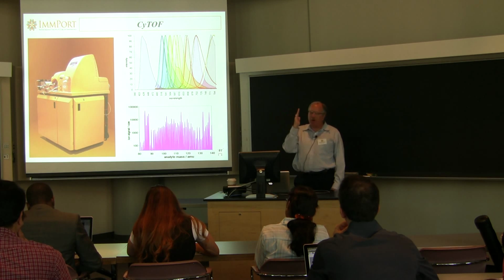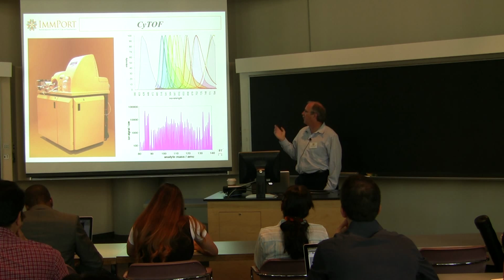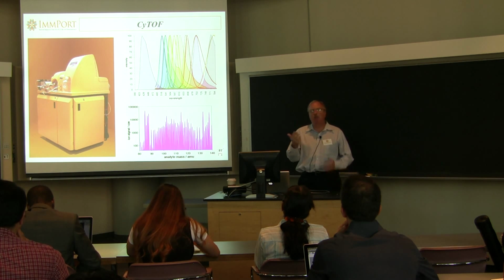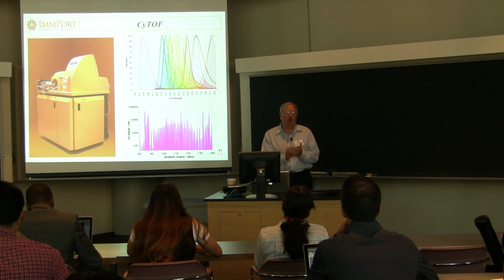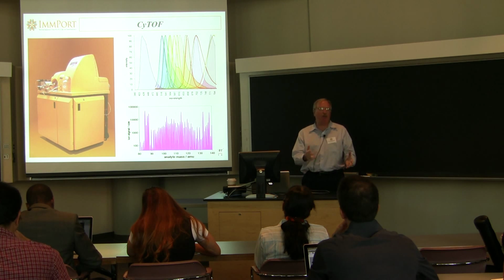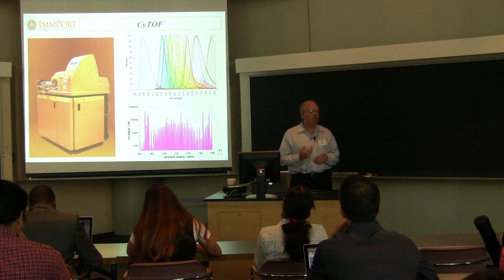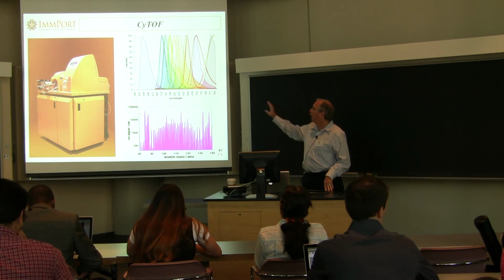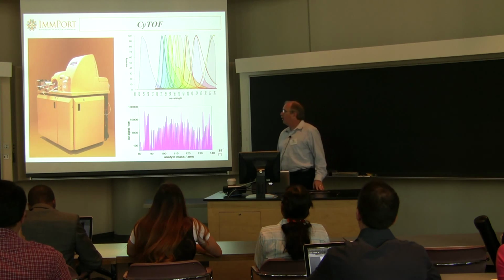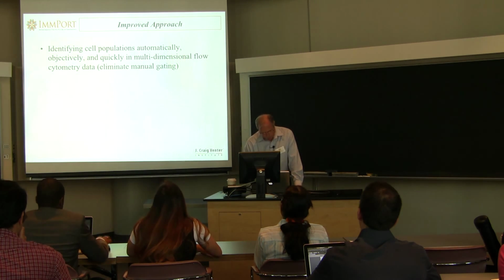And because that's a very precise measurement, now they're estimating that they'll be able to evaluate somewhere between 50 and 100 markers on individual cells, because they don't have to deal with the problem of spectral overlap of fluorochrome reagents. So now instead of dealing with 20-dimensional data, we have to anticipate being able to deal with 50, 60, 70-dimensional flow cytometry data with the data that's coming off of these kinds of instruments. So manual gating is just not going to scale to these kinds of technologies.